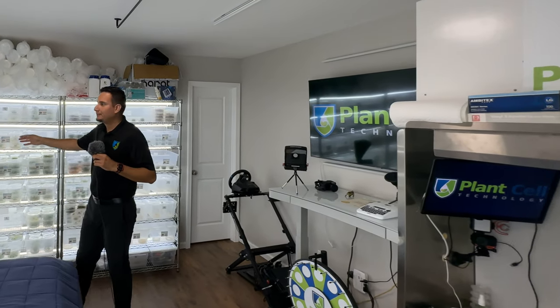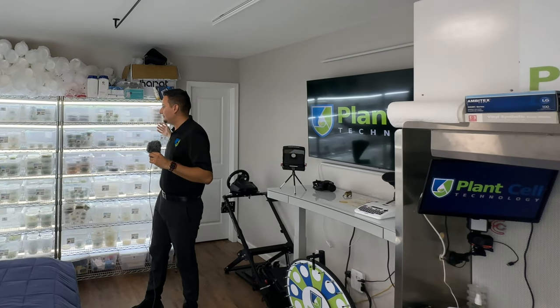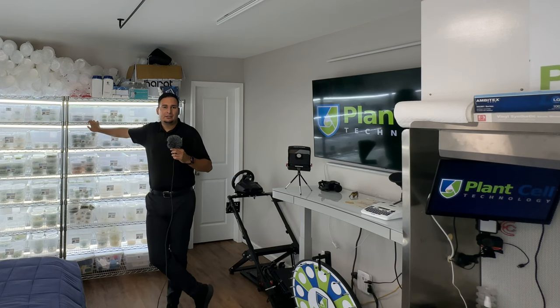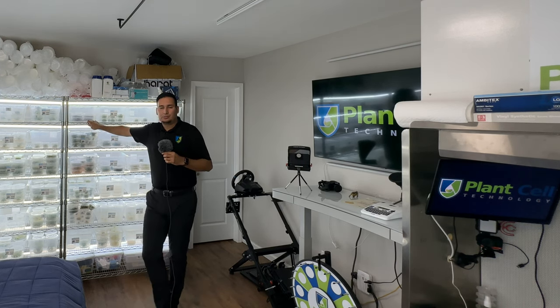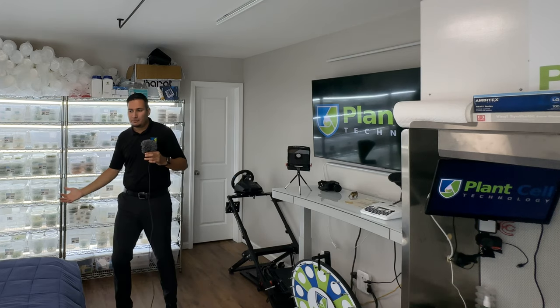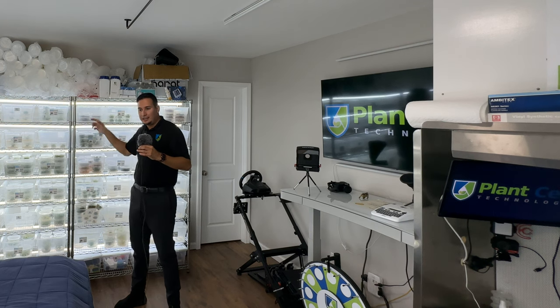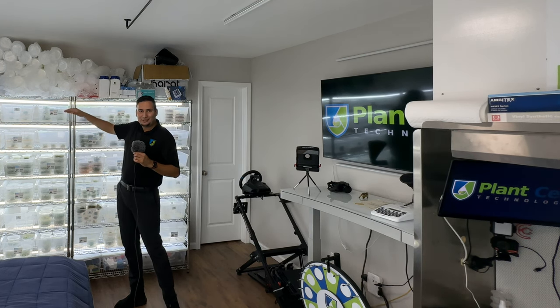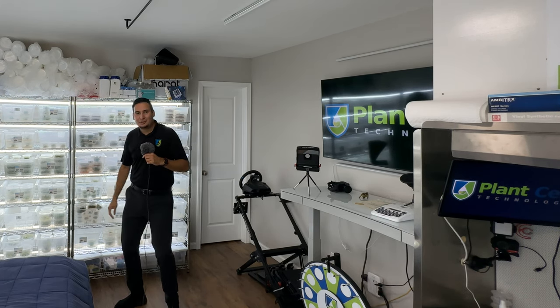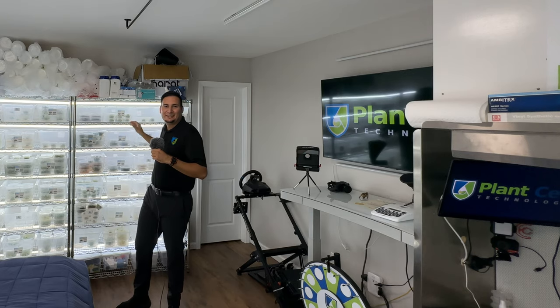Over here are my cultures. I have two of these shelving units that you can find at a big box store. To save space — since I'm in my room and don't have a ton of space — I took three shelving units and put all the shelves together so the spacing is a bit smaller, giving me a lot more shelves. I'm using containers to keep all my plants separate.